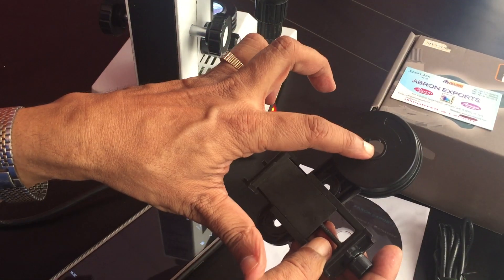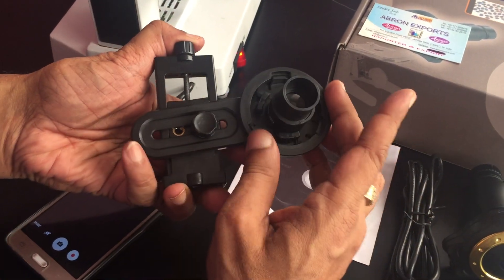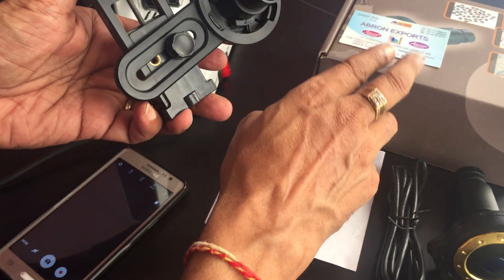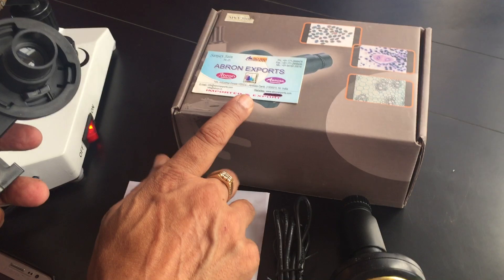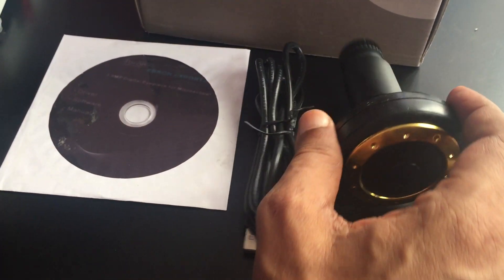This is an adapter for holding the camera, and this is for holding the eyepiece — just rotate it to tighten it. You can use it on any telescope. We also have other digital cameras: 3 megapixel, 10 megapixel.